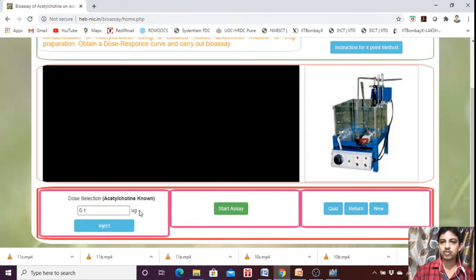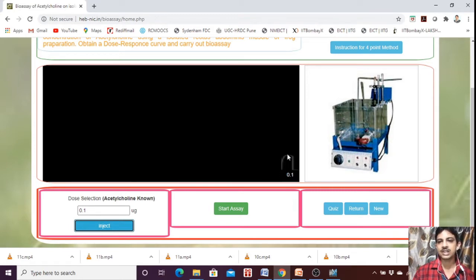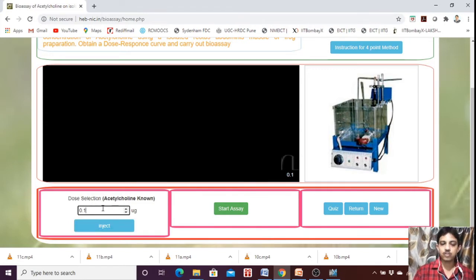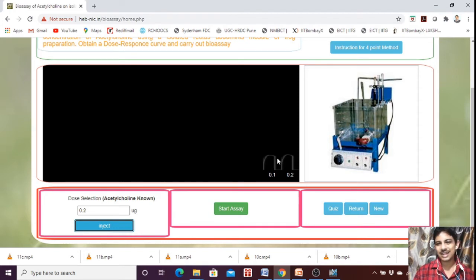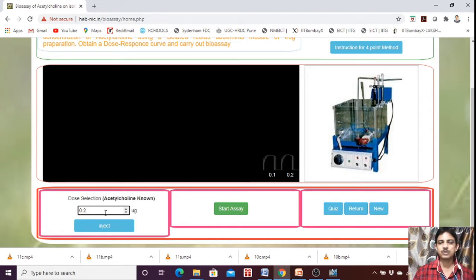What you need to do is just inject it. If you inject, you will get some response. Now for CRC, you should always double the concentration. But there may be no noticeable increase in the response yet.